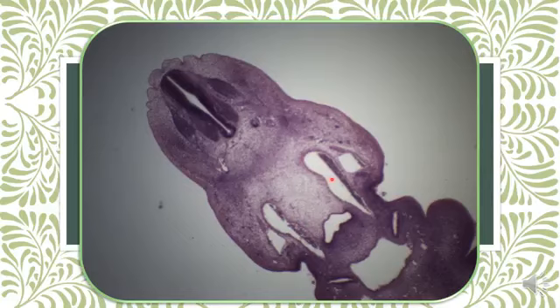Pharynx, bilateral dorsal aorta, cardinal vein, basal mantle zone, spinal ganglia.